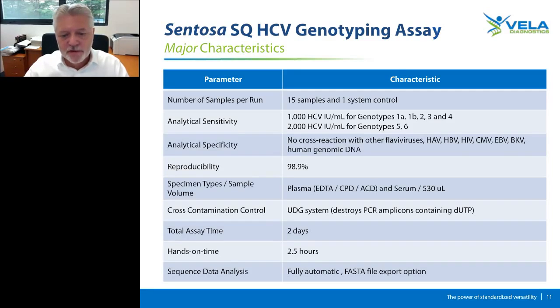Most recently, we have added another option to the software, in that we can now also export the FASTA files, which gives you additional advantages and options for your own data analysis if you want to use your own system.